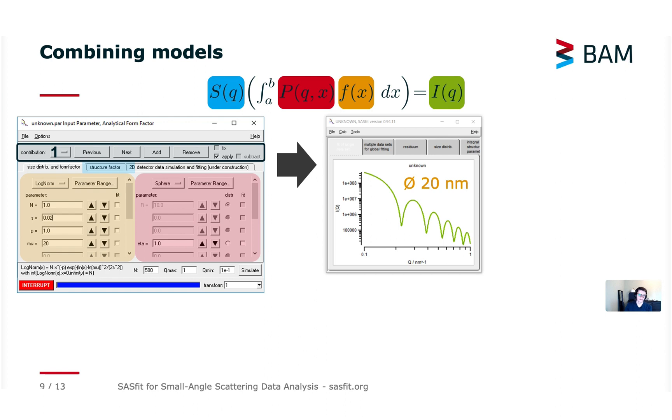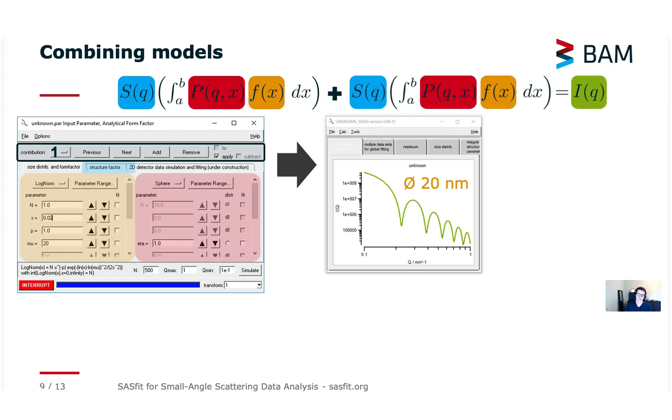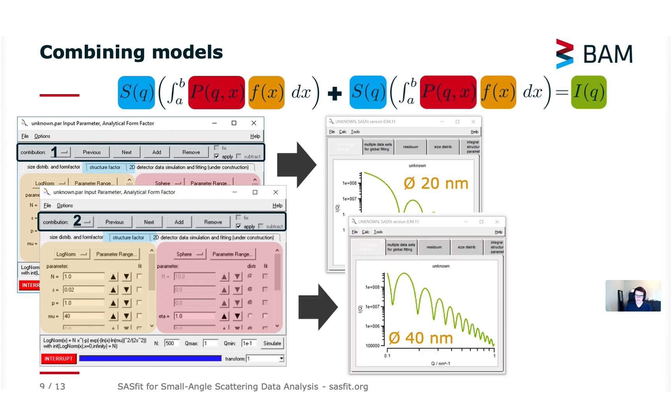First I configured a sphere with 20 nanometer radius with some size distribution or polydispersity applied and then I would add another contribution of a sphere which is just slightly bigger for example 40 nanometers and also with the polydispersity applied and the result of the intensity will then be the sum of the two intensities of the two models I configured.